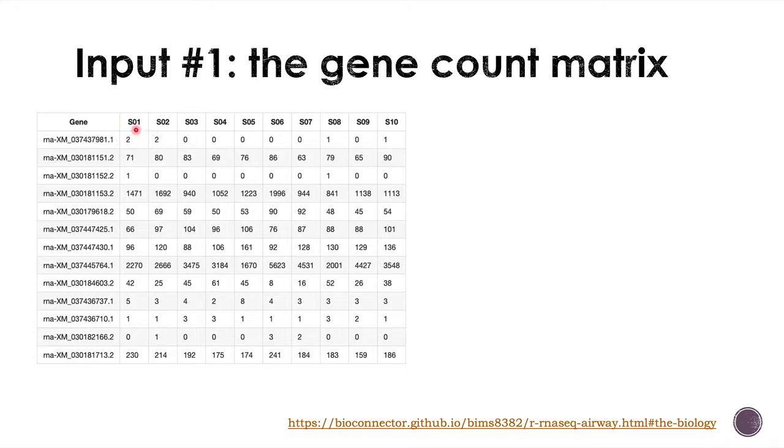So in the first cell, you will have, for example, a count of 2. That means that this gene was estimated with 2 reads in this sample. It was detected 2 times in sample O1. Some genes will have only 0 counts, so not like this one, but imagine the one here and one here are zeros, then this gene will not be detected, but still you will have a complete row of zeros for that gene if it's undetected. And some genes will have a lot more counts than others. That's also something to remember.